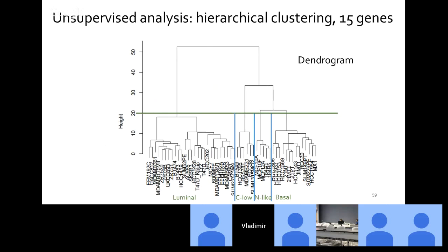We perform clustering based on the complete set of genes. We see that samples can be divided into clusters, and we select genes that differentiate these clusters as much as possible, for example, using a conventional differential expression analysis we discussed in the first part of our workshop.